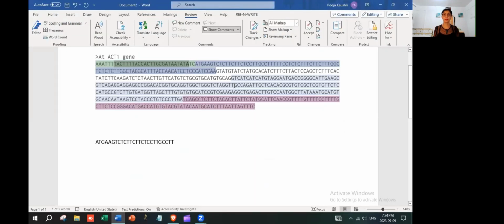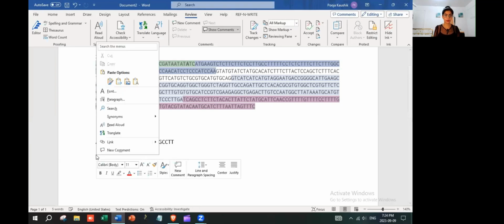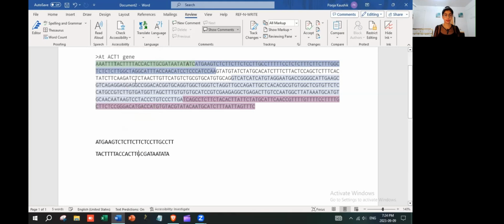The primers still work, like it has worked for me even after showing some bit of primer dimer and hairpin structures. It has amplified my genes. So it is a good idea to try amplifying, and then if it doesn't work, then go for the second option. I'll also paste the second primer, so that at later stages I will tell you how the naming of the primer differs if you take it from the exonic regions, and if you take it from the 5' UTR region.